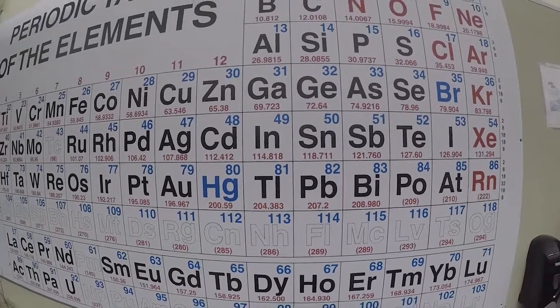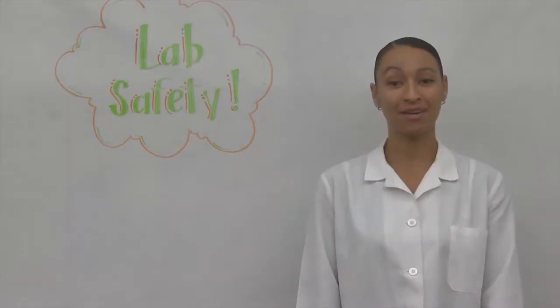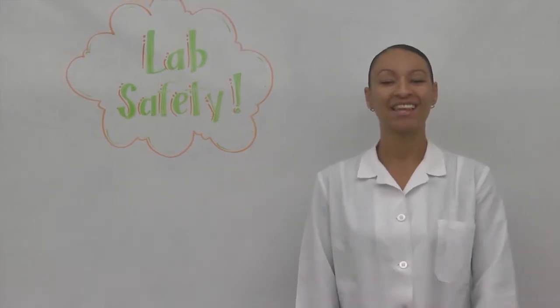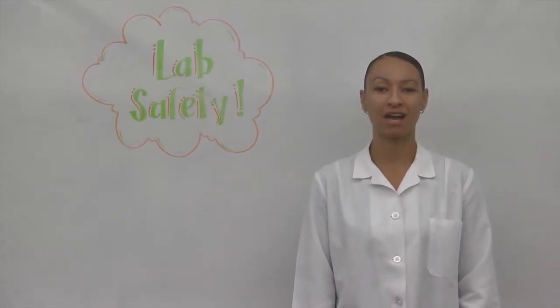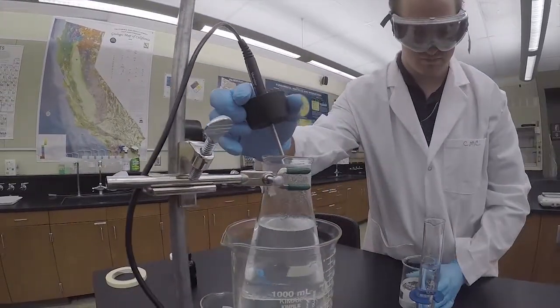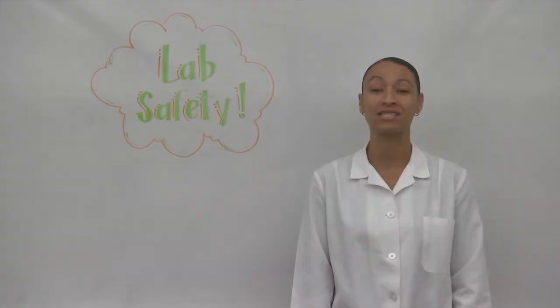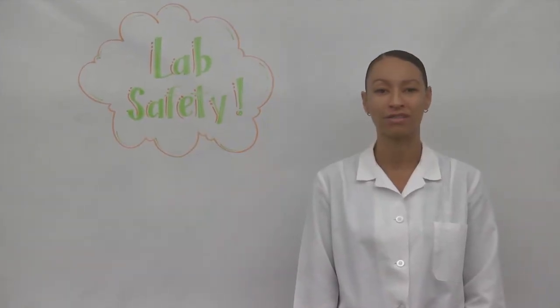to the CMC Laboratory, a room you will become very familiar with. Today's topic, lab safety. Lab safety is a major component of science education and is a vast culture you are very much a part of. Lab safety was developed to protect you based on past experiences from skilled scientists all over the world.